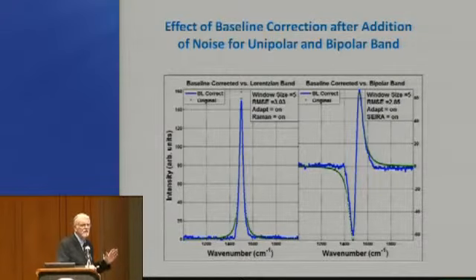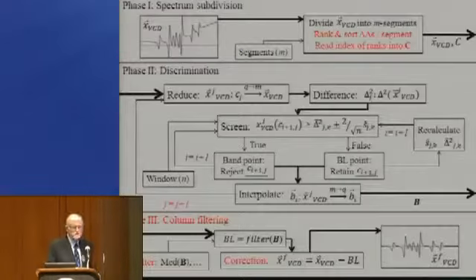I mean, it's still there at the right frequency, and the same thing for a bipolar band. So it's actually a slight resolution enhancement as opposed to a resolution degradation.